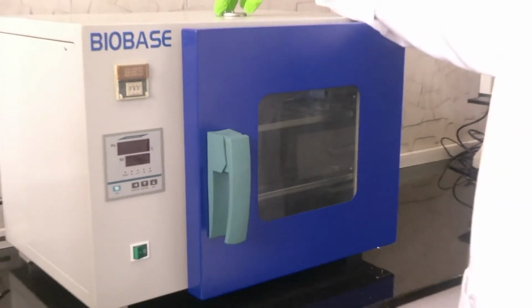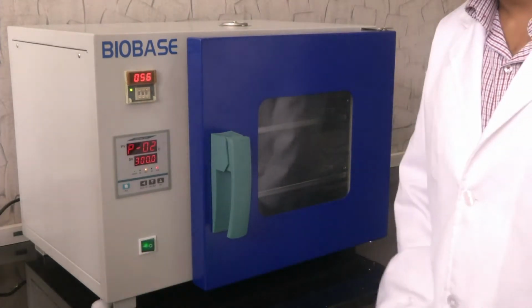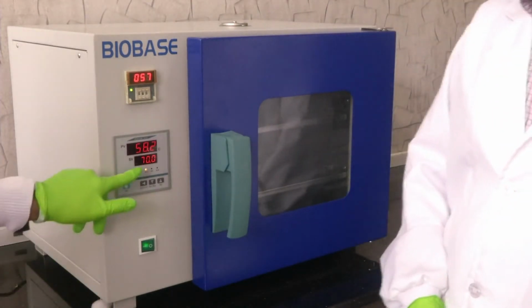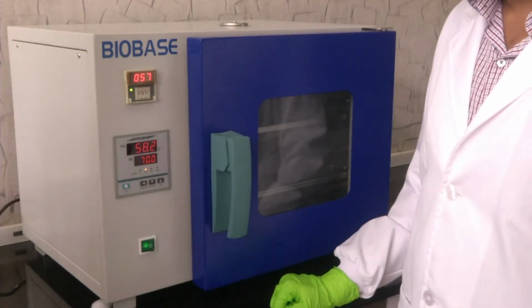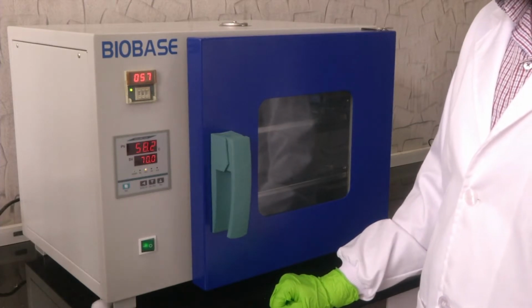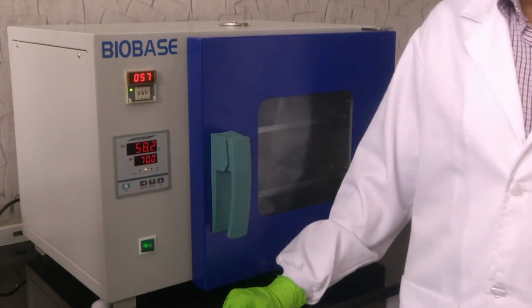Now we will switch on the oven. That sound came, and the set value is 70 degrees Celsius as we had set it before. So it will retain the memory from the previous power on, and it will try to ramp up to 70 degrees Celsius inside. Let us just give it 2 minutes. While this ramps up, we will discuss a few precautionary measures that we should take care of.